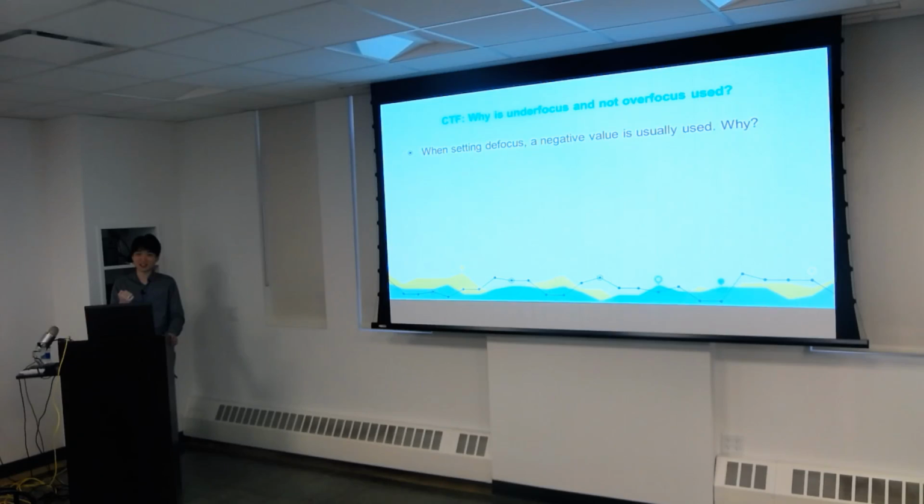Not really a crossover, but yes, there are differences between the positive and negative that have to do with the equation itself. If you look at the equation more carefully, and she enlightened me about this quite recently, there's actually a minus sign over here. So your defocus value is over here. So this is the contrast transfer function.